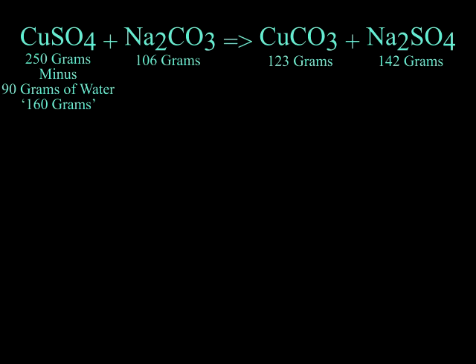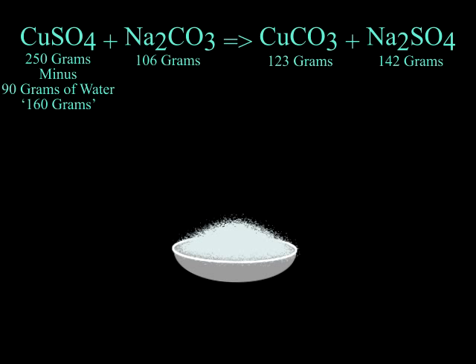To finish our synthesis of copper carbonate, we let it sit until it has settled, then we decant off the water layer, and then filter and wash with acetone to get rid of any unreacted salts and help drive off water for drying. After you recover your copper carbonate from your filter paper and let it dry, you can powder it and get it ready for the next step.